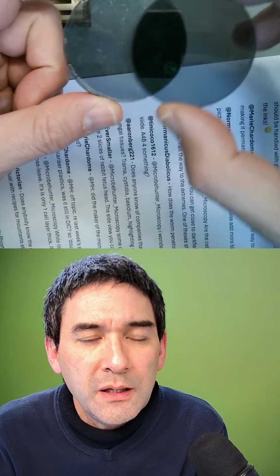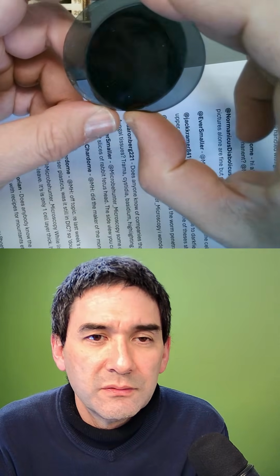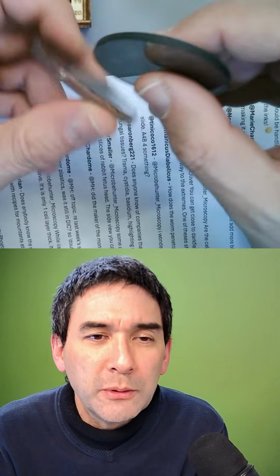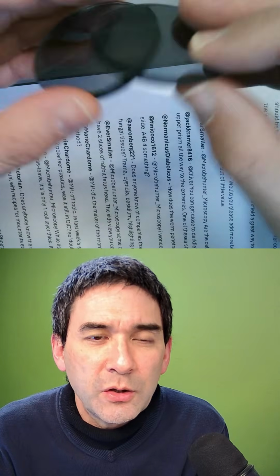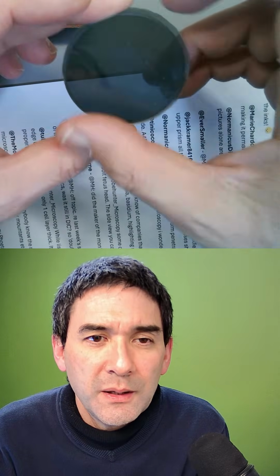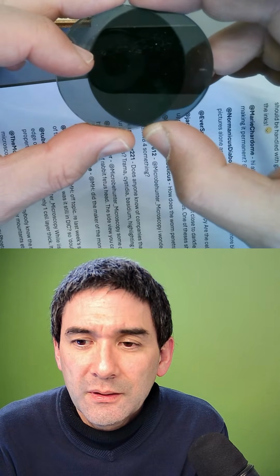You can use plastic filters, and basically what I've done is I've simply placed one on top of the slide and one over the lamp, and I removed everything else. So it was just basically cross polarizing. That's something that can be done quite cheaply. I would probably not buy those glass ones. I got them from very old camera filters. But they are extremely cheap polarizing plastic filters.